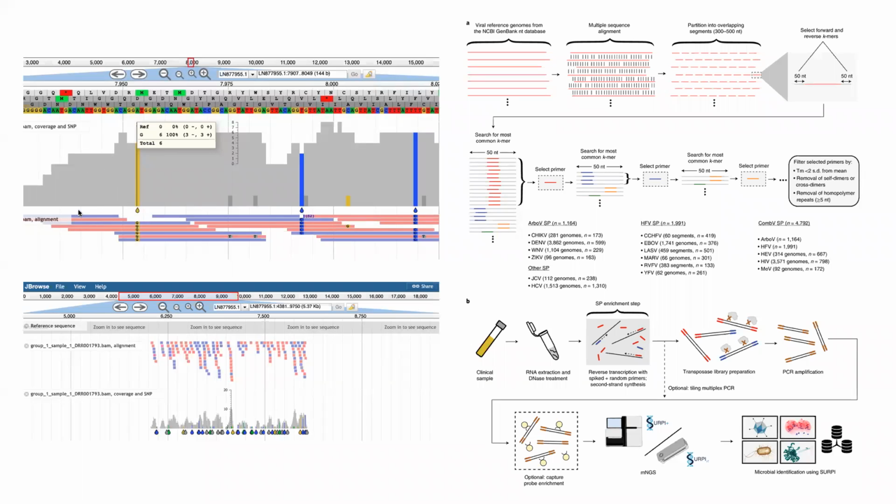So we saw the reads, how they align. We talked about coverage. And then you probably noticed that some positions were different from the reference genome. So for example, here it's C, here it's T, right? So those are the differences. And this is what we are going to be talking about today. So today we're actually going to be talking about how do we go to the next step and understand what are the differences in the sequences that we are finding.